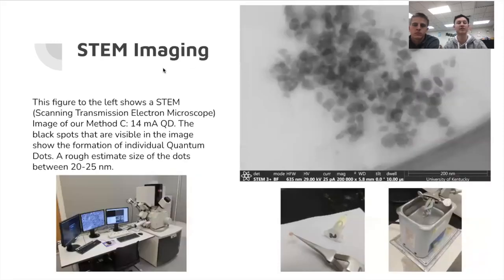We also sent some of our samples to the University of Kentucky, and Dr. Barut was able to put our samples in a scanning transmission electron microscope. Using this machine we were able to get some of these pictures of our actual quantum dots. You can see here from these pictures we're able to estimate the size of our quantum dots, so we believe they're between 20 to 25 nanometers, which is very good data for what we were looking for.